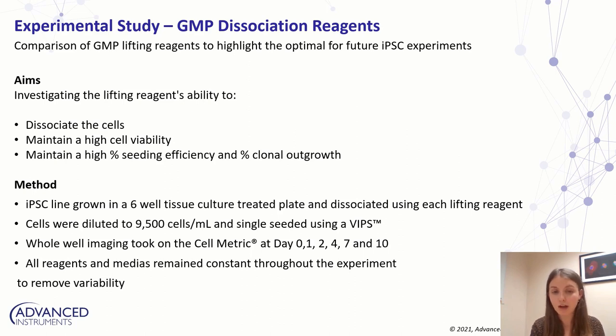Further time points took place for Cellmetric scanning, and this was at day 1, 2, 4, 7 and at day 10. And just as a note, all reagents and medias remain constant throughout this experiment to remove any variability and to allow the data to be comparable.